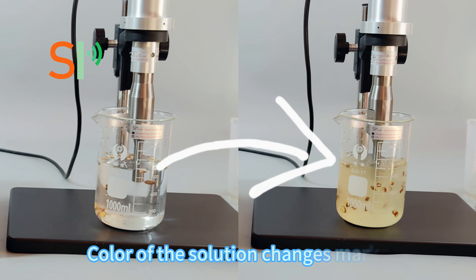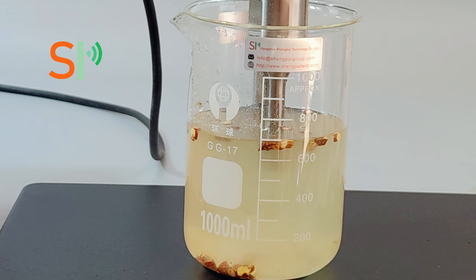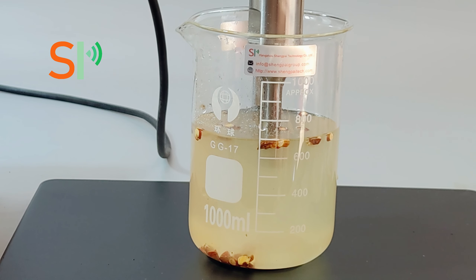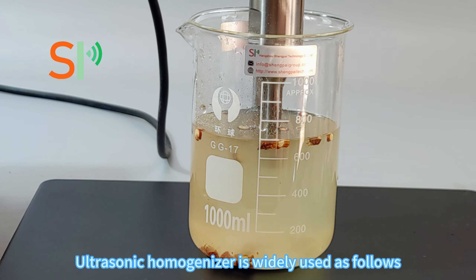The color of the solution changes markedly. The ultrasonic homogenizer is widely used in various applications.